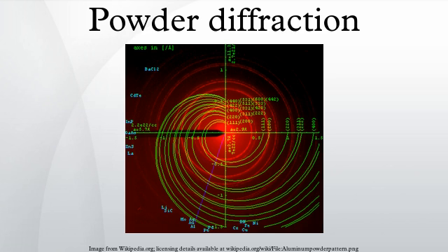Other sources. In-house applications of X-ray diffraction have always been limited to the relatively few wavelengths shown in the table above. The available choice was much needed because the combination of certain wavelengths and certain elements present in a sample can lead to strong fluorescence, which increases the background in the diffraction pattern. A notorious example is the presence of iron in a sample when using copper radiation. In general, elements just below the anode element in the periodic system need to be avoided.